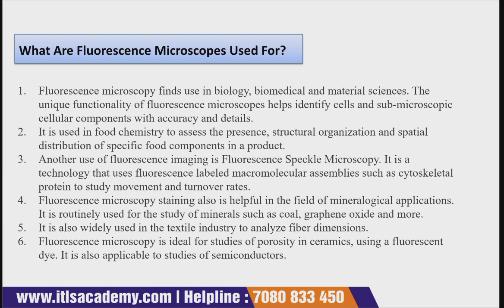It is routinely used for the study of materials such as coal, graphene, oxide, and more. It is also widely used in the textile industry to analyze fiber dimensions. Fluorescence microscopy is ideal for the study of porosity in ceramics using a fluorescent dye. It is also applicable to the study of semiconductors.